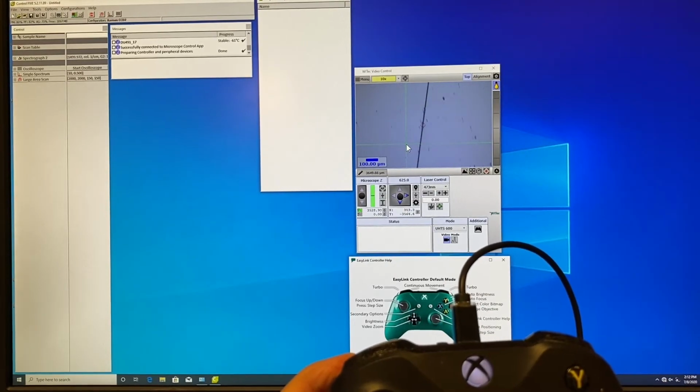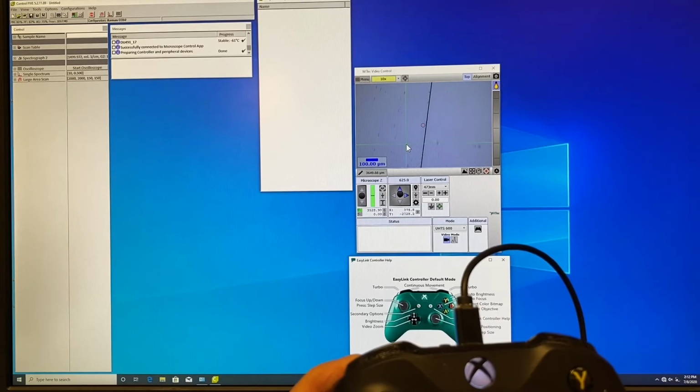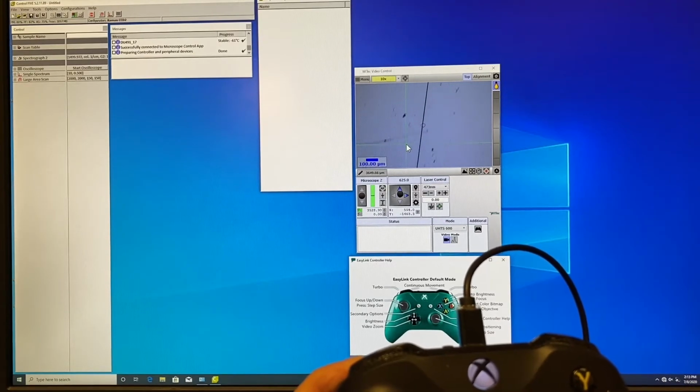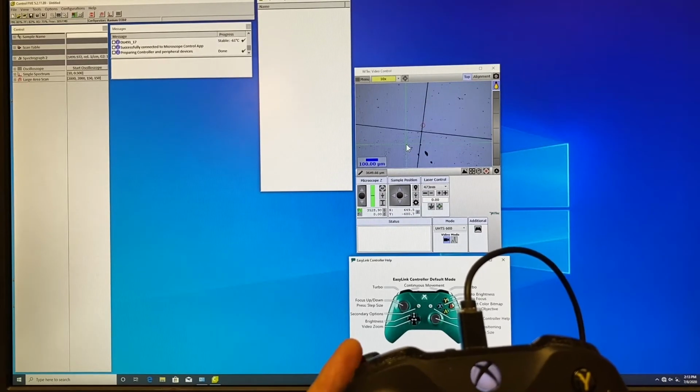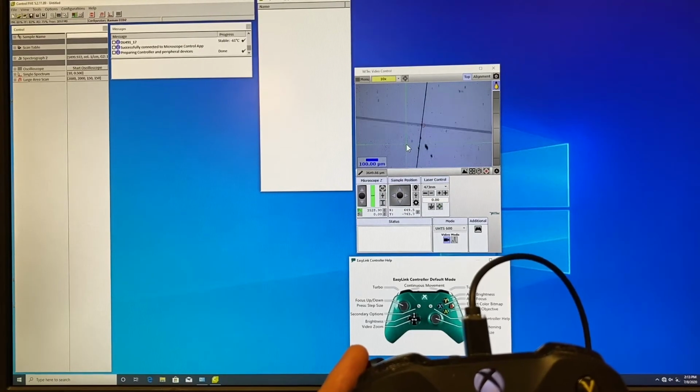So we have a pre-cut cross there. Okay, so this is the edge. Let's go in the opposite direction. So here's our cross where we will start collecting our Raman spectrum.